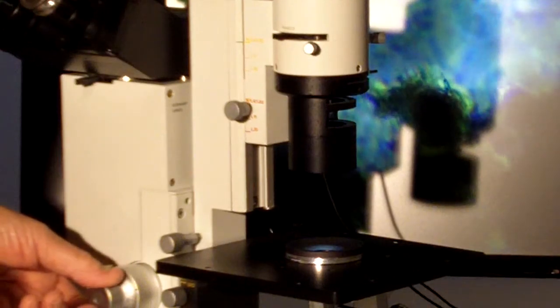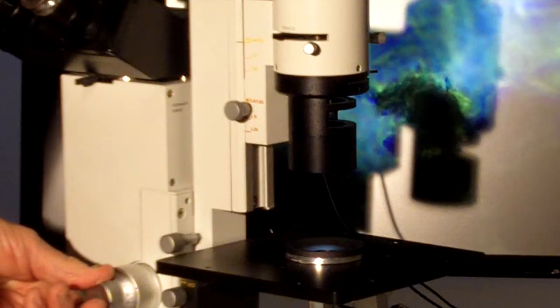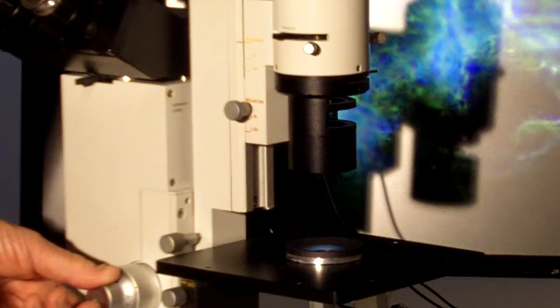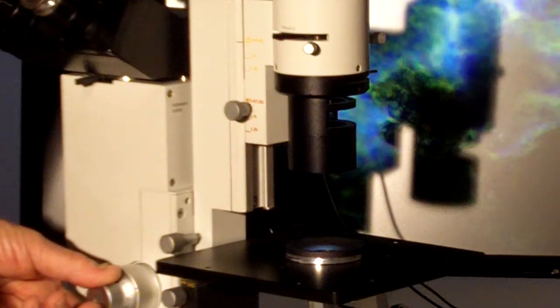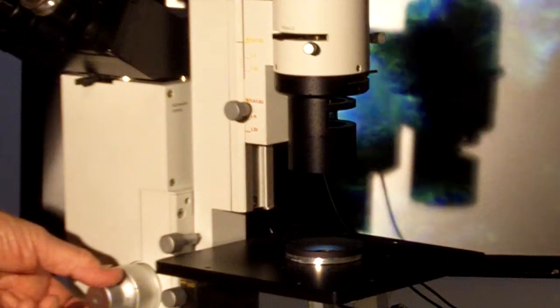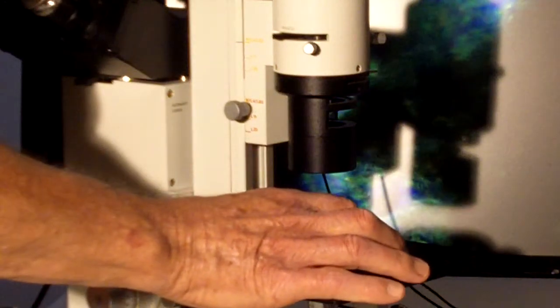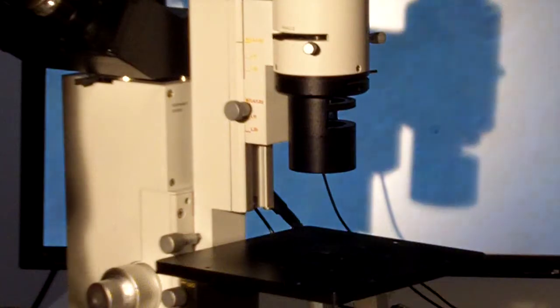These days they may even be looking for microplastics in the local streams or ponds. We've got some movement going on there. I'm not sure what that guy is. Something's kicking up the dust but that is all subject to exploration.